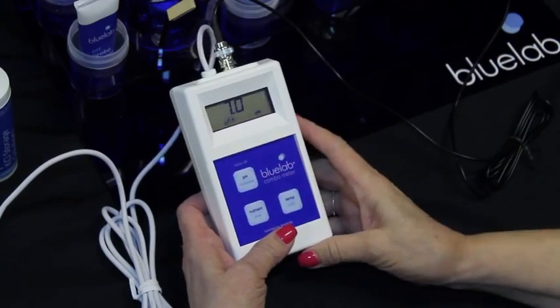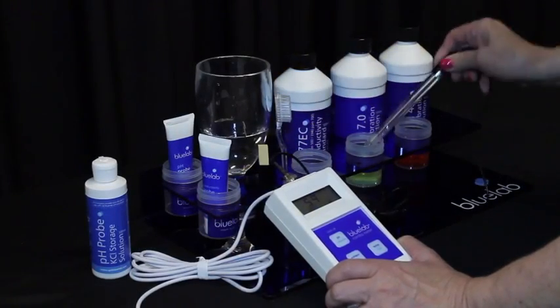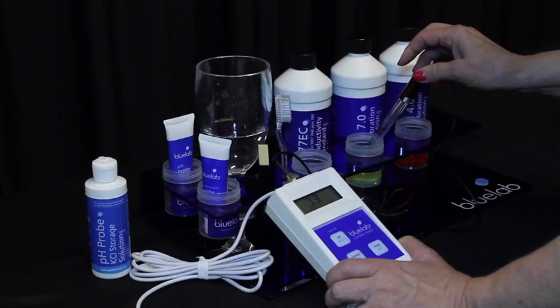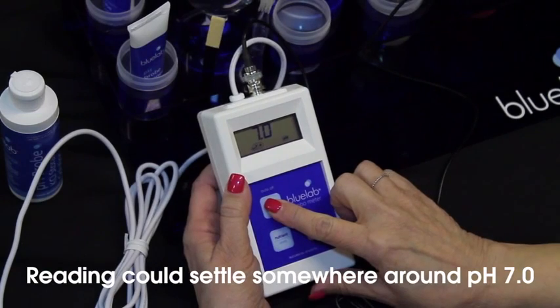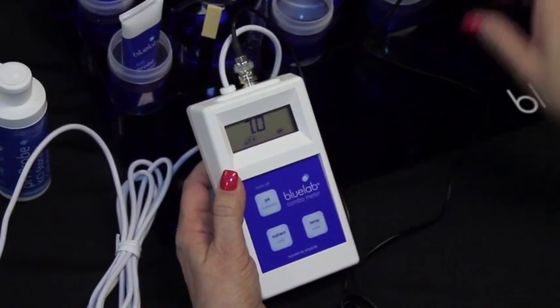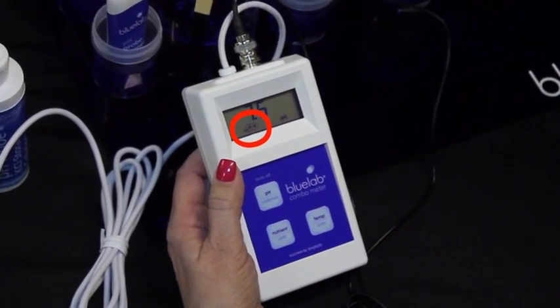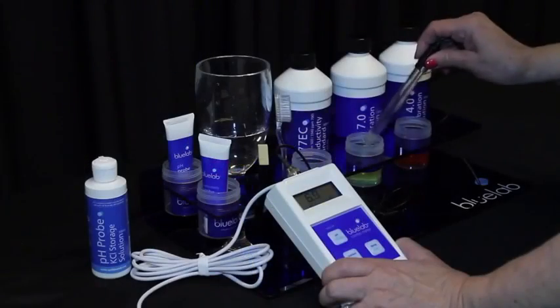Turn the meter on. Place the probe in pH 7.0 solution and be sure to wait until the reading has stopped moving. Press and hold the pH button until the display shows CAL. The pH 7 indicator will be displayed, and the pH 4 indicator will flash to let you know that pH 4.0 calibration is now required.